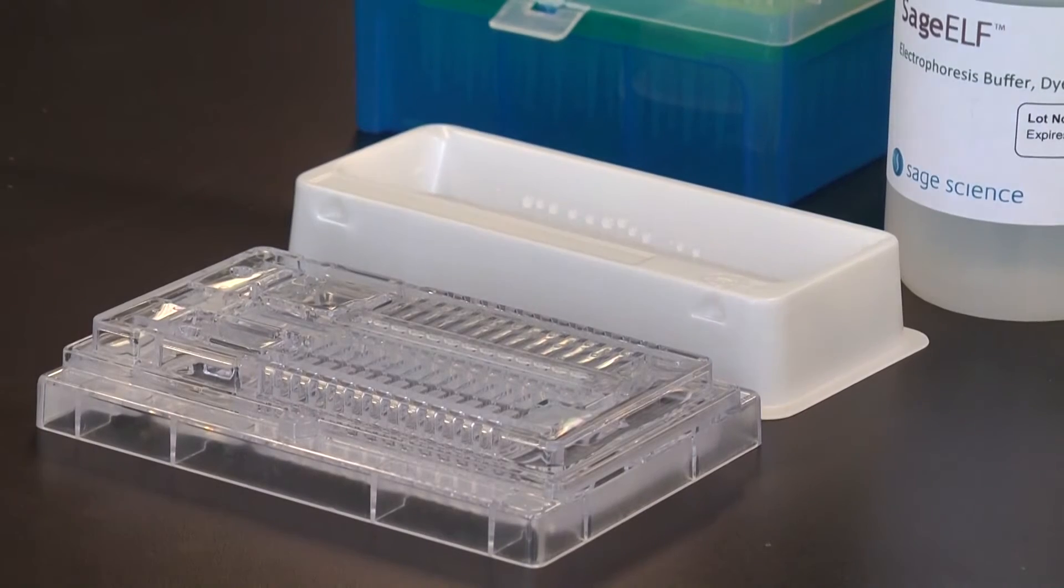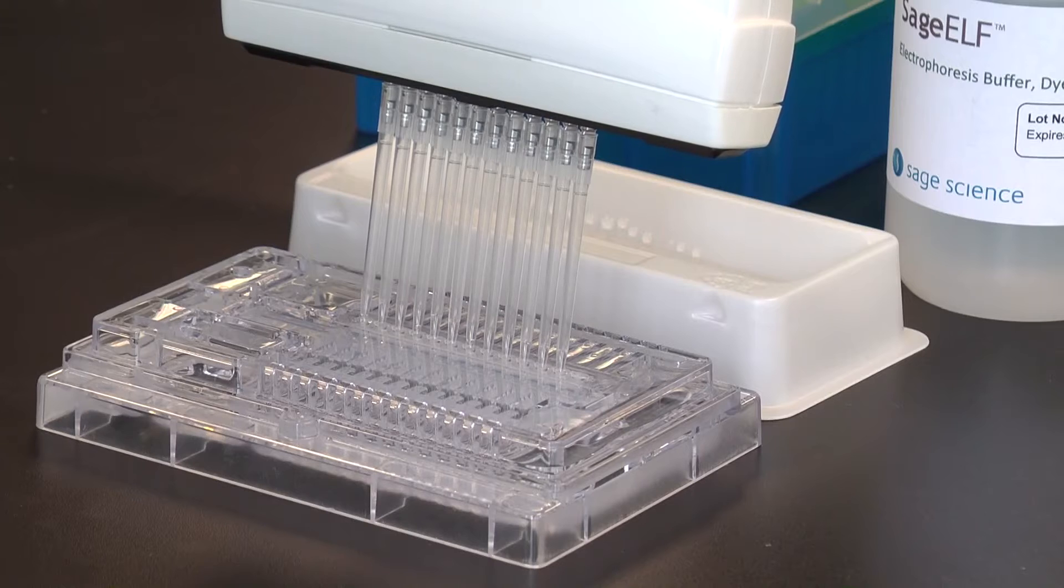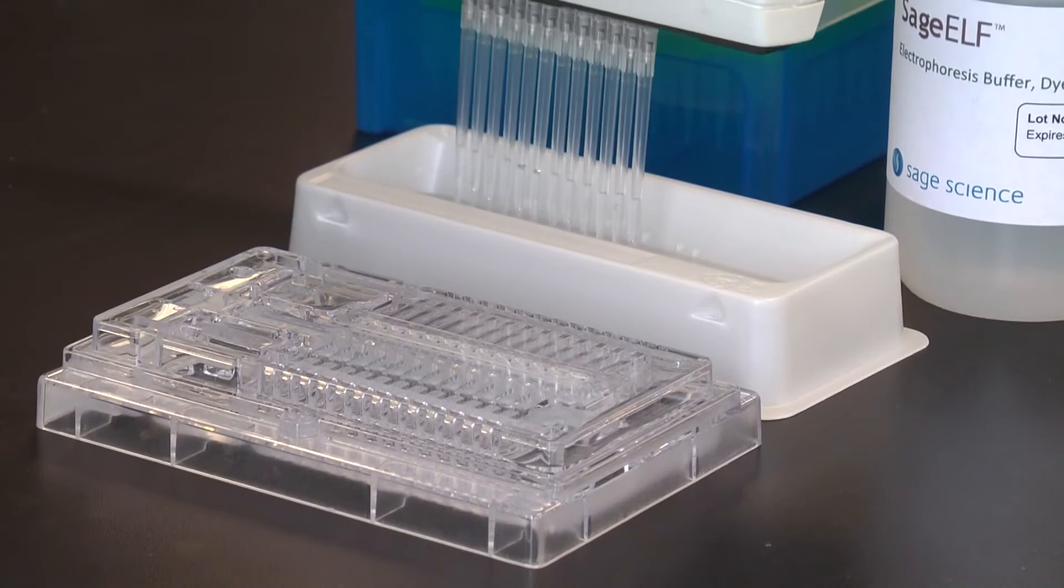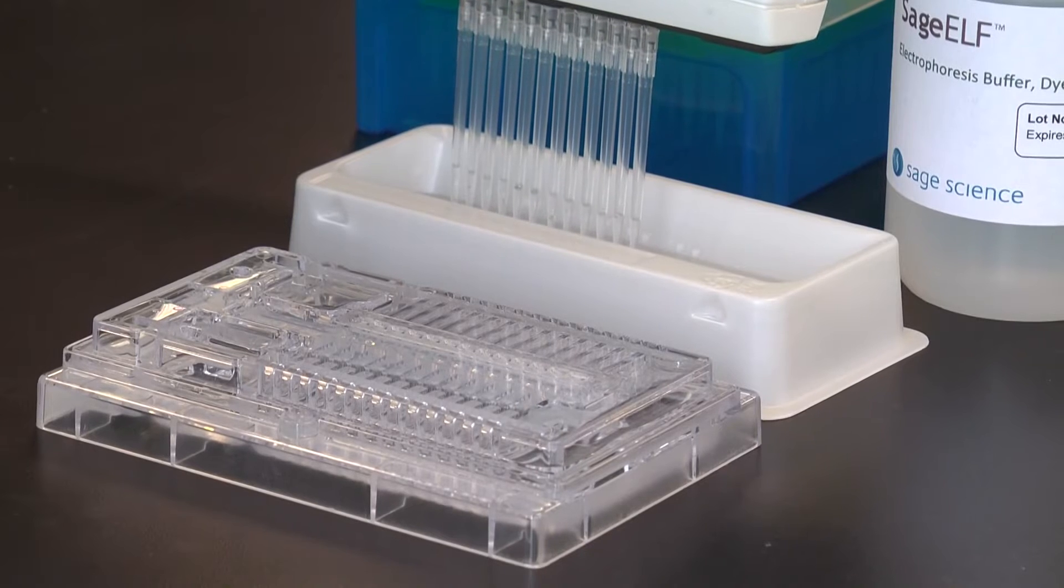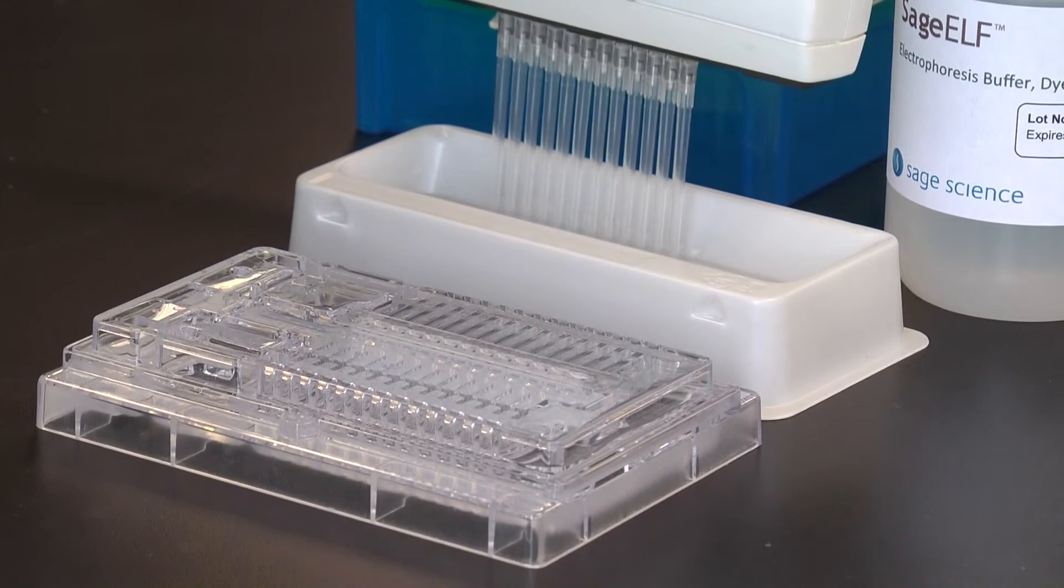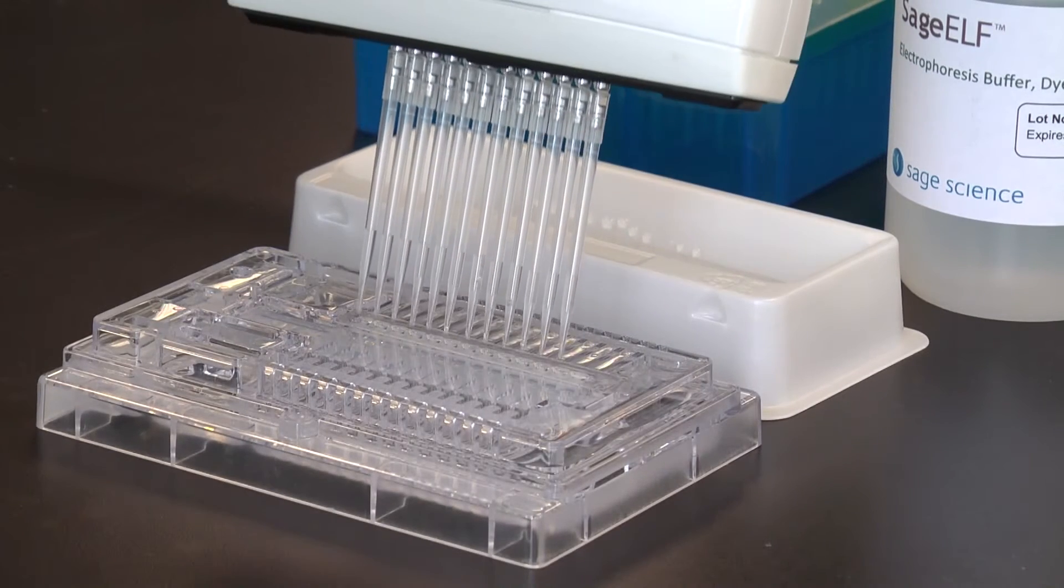Remove buffer from all thirteen elution wells. Set pipetter to 40 microliters to completely empty the wells. Keep the pipette tip vertical in the well to avoid damage to the membranes. Add 30 microliters of fresh buffer to all thirteen elution wells. Take care not to introduce additional bubbles into the elution modules.